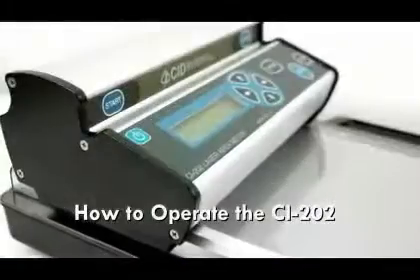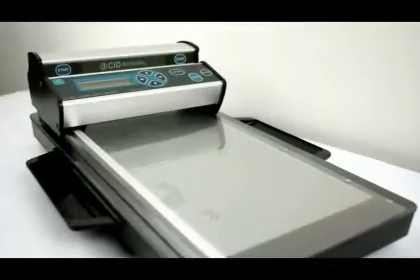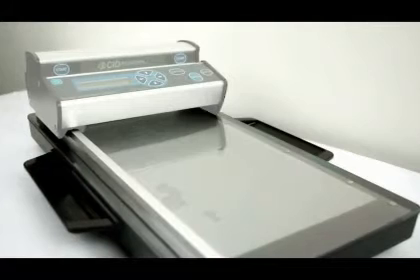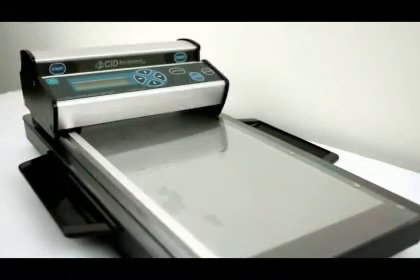The CI-202 Portable Laser Leaf Area Meter features a high resolution laser scanner, data logger and display enclosed in a single handheld unit weighing 1.8 kg.